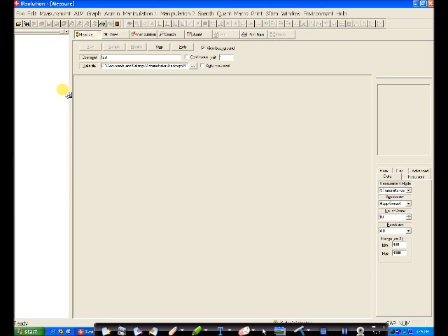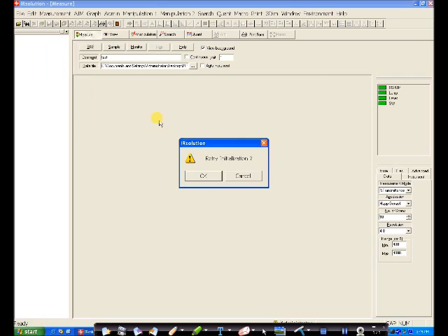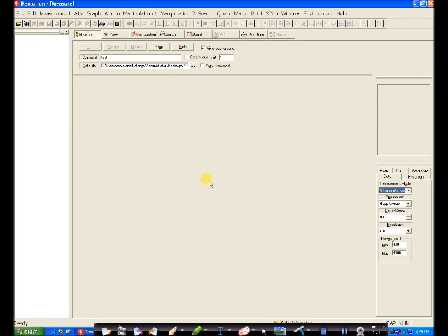The window pops up, and the first thing you should do is go to the top tabs, Measurement, and under the first one, you see Initialize, or it says here Reinitialize. If you're the first user of the day, you have to start the initialization.